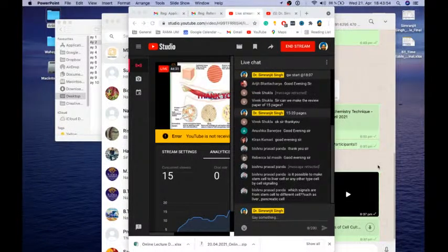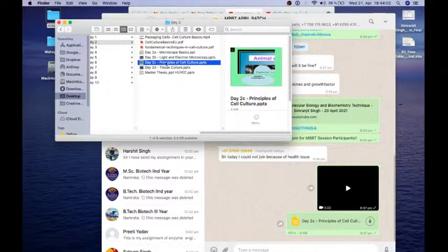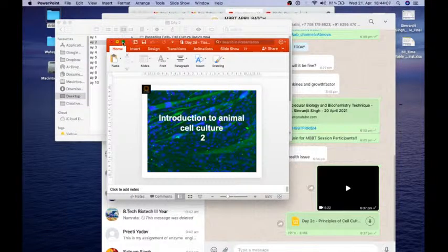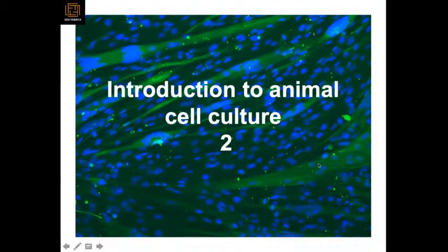I have shared the video of passaging the cells and also the principle of cell culture. Now I will take you through the next 15 minutes. It's a repetition of the same thing. It's not much actually, but still I want to show you some cell cultures, how we do it. This is the second part of the same.